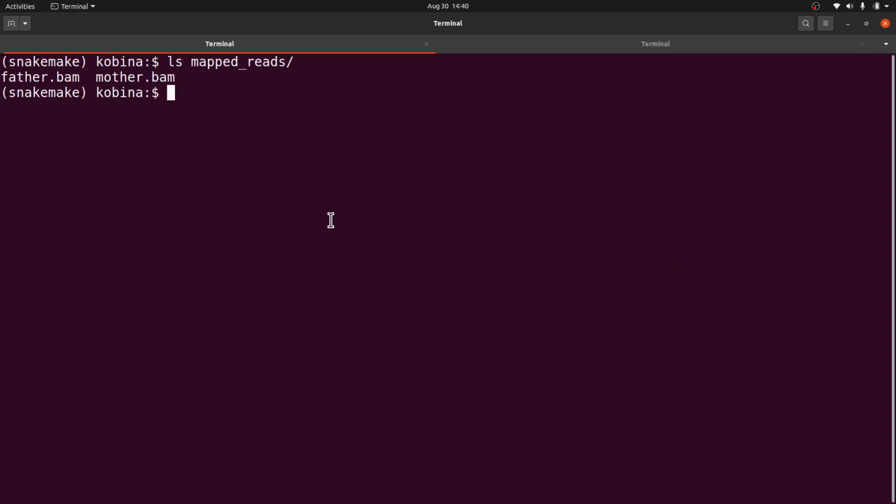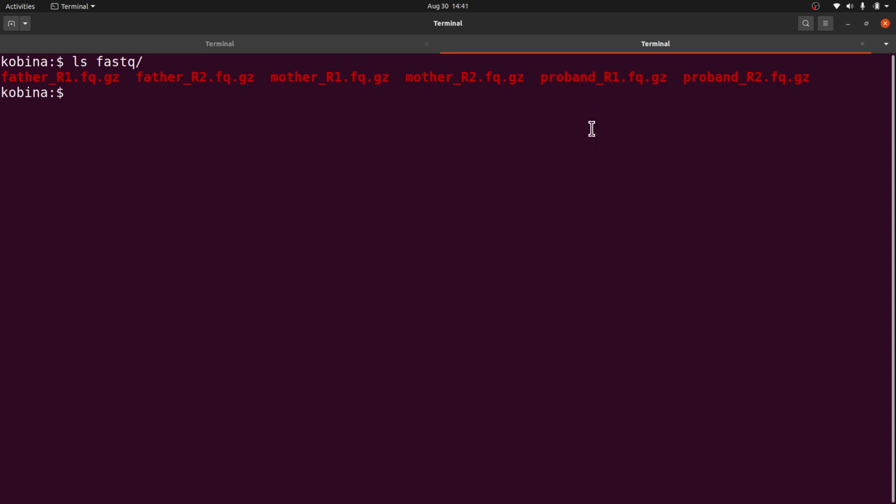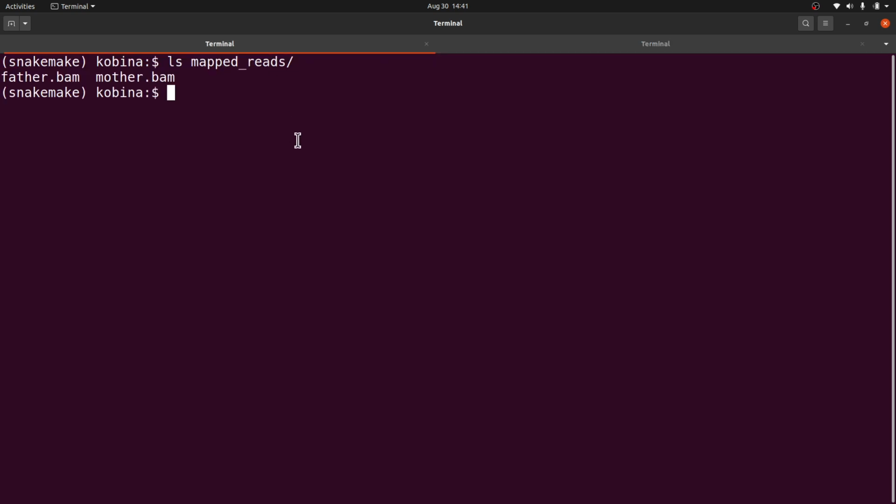With the approach we used, we specified the files on the terminal like this. But in some cases, specifying the inputs or the outputs on the terminal can be cumbersome. So it's possible to specify the information in the Snakefile itself. I'm going to show you this other approach to specify all samples of interest in the Snakefile and then use that.